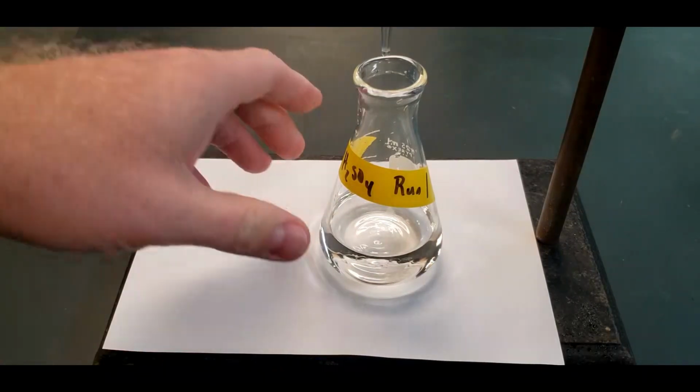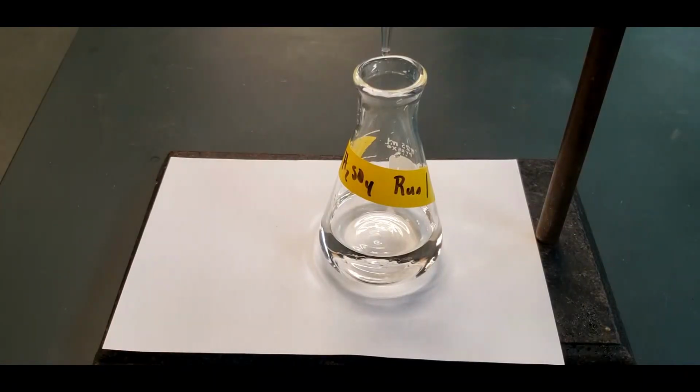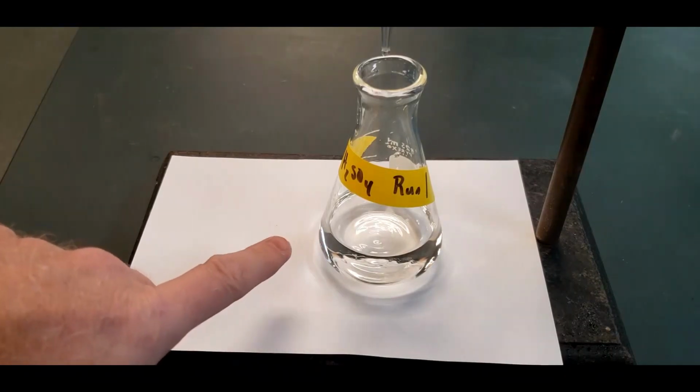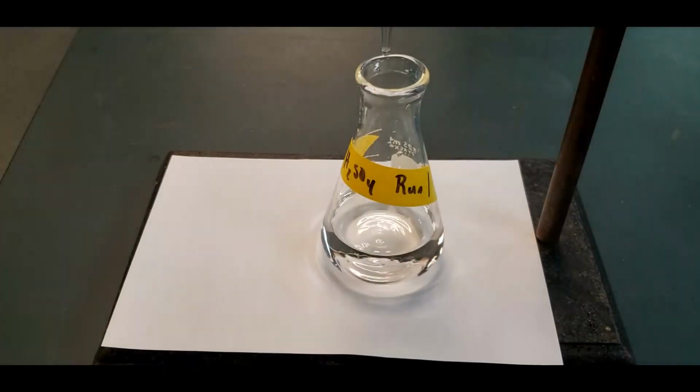So I'm going to run through this whole thing. Just from this perspective, I won't show the solution draining down through the burette. I already showed that, and that's what it will basically look like. It's going to end up being some number, and then I'll show you that one. I'm going to do this one on camera, this run, and then the other 2 runs, I'm just going to give you the data. I'm going to do that for each. So you're going to have 4 titrations that are shown for each of the different samples, and then I'll give you the rest of the data. That will save a little time for the video.